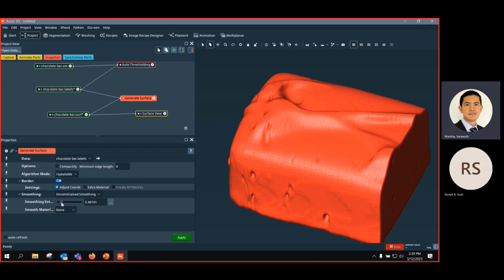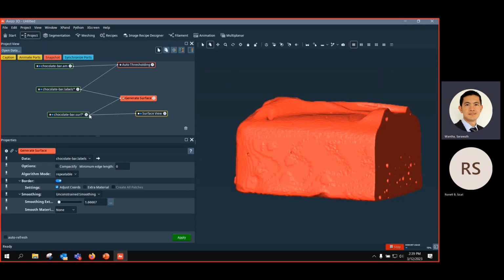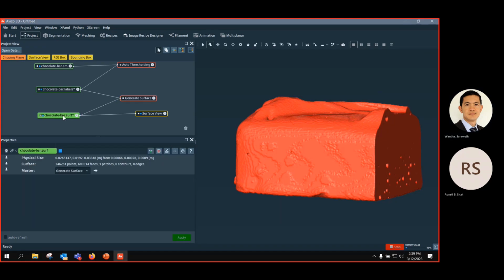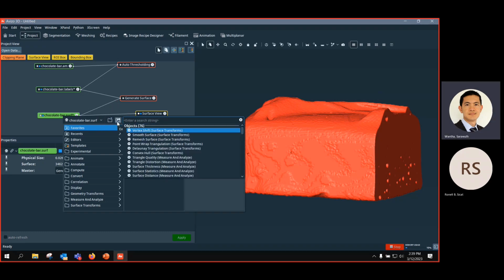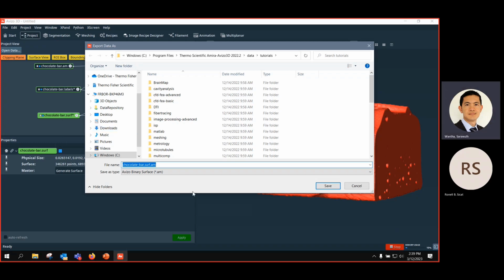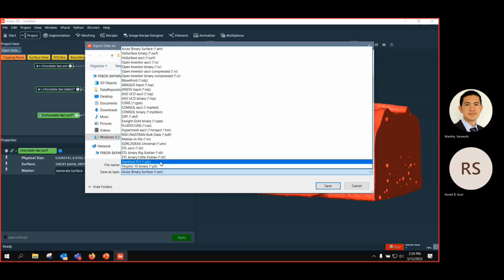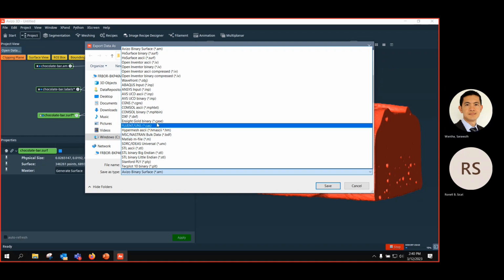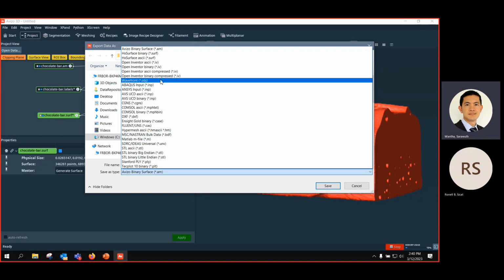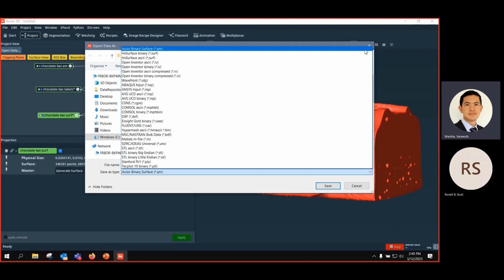But if you go back to like maybe 1, there will be some warning. They're gonna create so much triangulated surface. But yeah, it depends on how you like to smooth them. And after this, you can export them. So you click on it and you can see this export option. And then you can just select, for example, you want to print them. You can select the STL file. And we can also select, for example, OBJ. Where is it? Wavefront OBJ. So this is for 3D printing. Imagine you want to segment a certain part and print it for 3D printing. So that's possible with the surface.